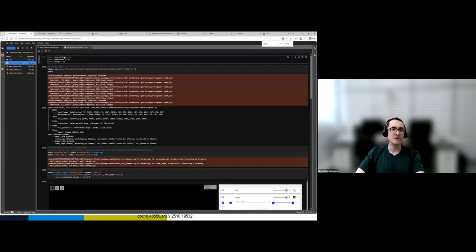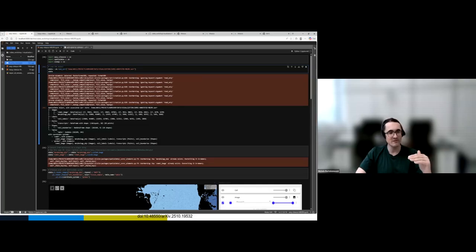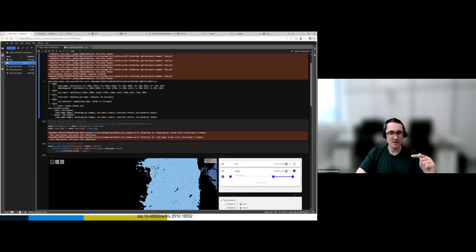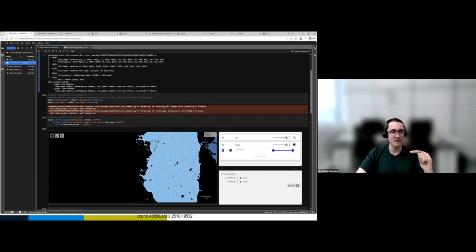Okay, so I import the packages, read and load the object. So here is my SpatialData object with the images, the labels, the points, shapes, and tables. I quickly set up the images, and then I call just one function with a few lines where I say, I want this image component with this channel.